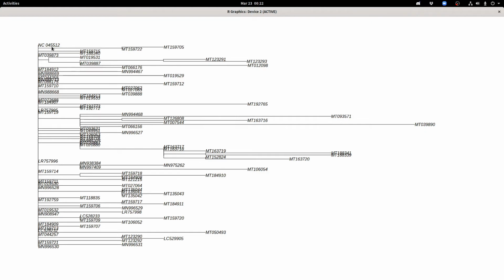So we have a phylogenetic tree in which our sequences are labeled at the tips, and you can see because this is sort of an outbreak, we have a whole bunch of sequences that are very independent of one another. So this is what is known as roughly a star cluster, and individual sequences. This doesn't tell us too much because these are sequence IDs, so we're going to change it and plot it so these have some of our metadata. On this occasion, we're going to use the location of the sequences.